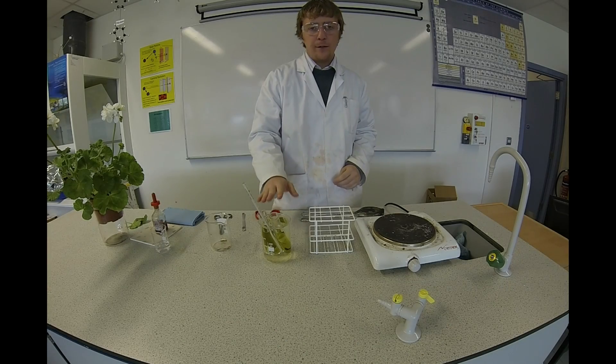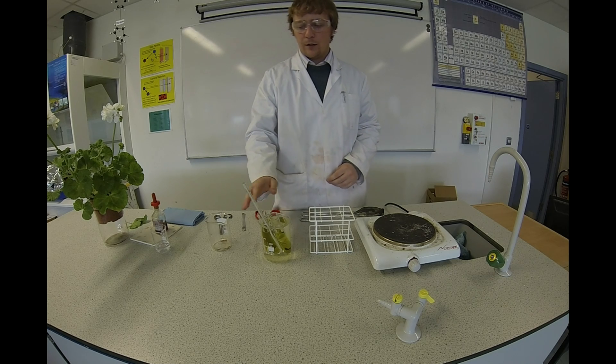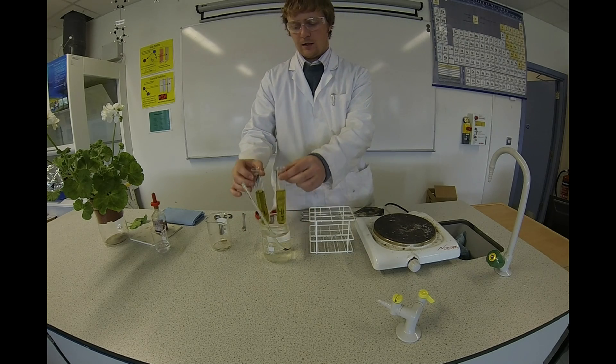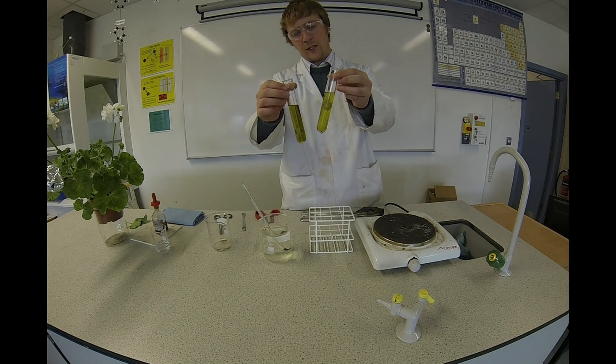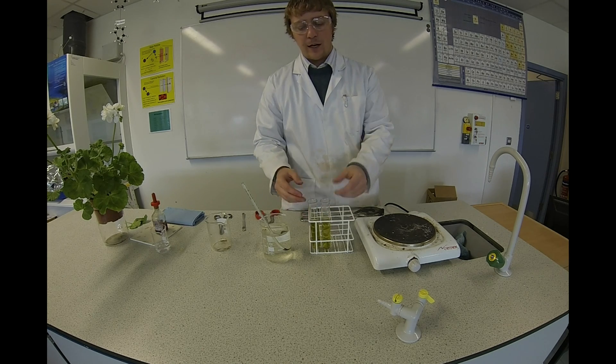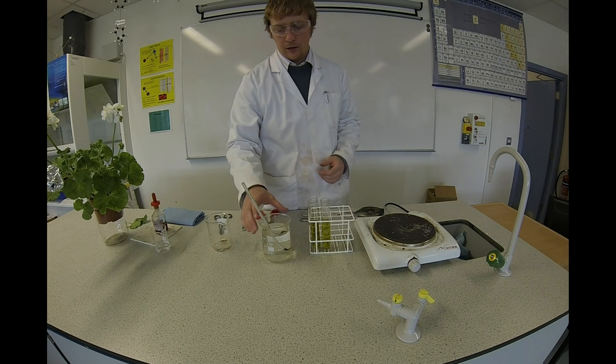Our leaf samples have been sitting in the alcohol for about 10 minutes and you can see that the alcohol has now turned a green colour — that shows all the chlorophyll from the leaves has been removed and it's now dissolved in the alcohol.